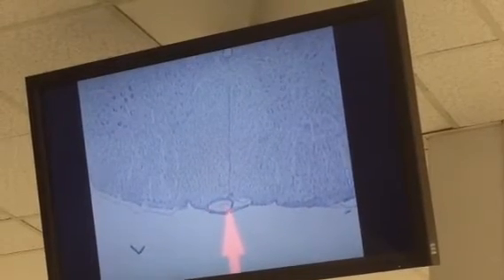Inside of it and get acquainted with what it looks like when you're looking at neurons and glia in a Nissl stain. Okay. At low mag, same kind of magnification. Just going to kind of run around a little bit. And then before we zoom in, here's my ventral spinal artery.